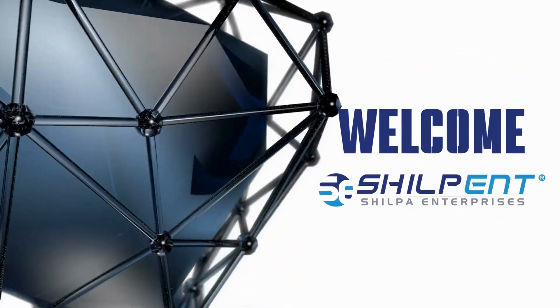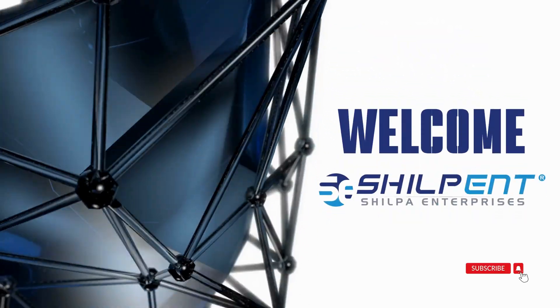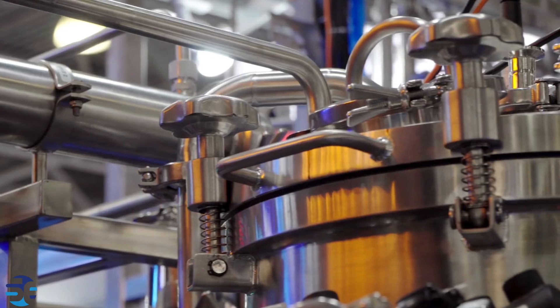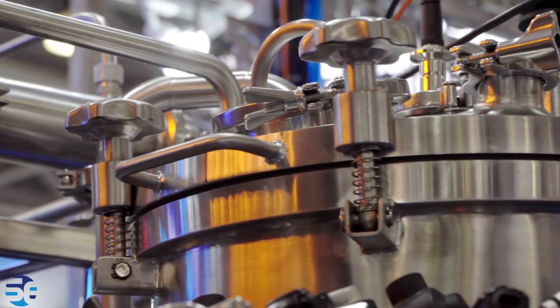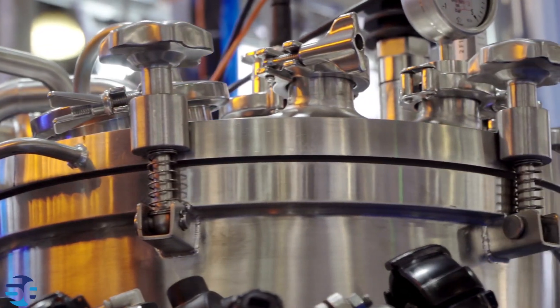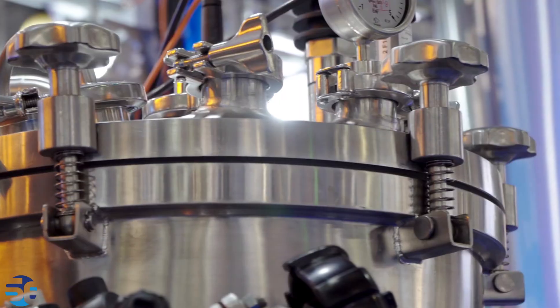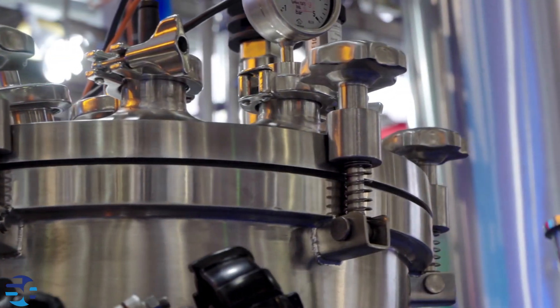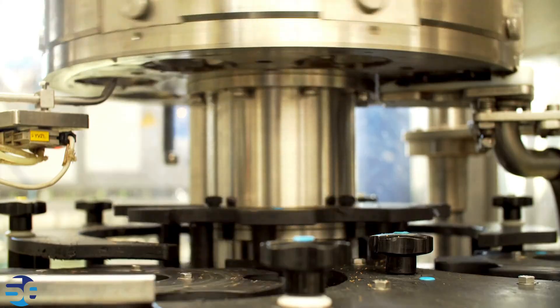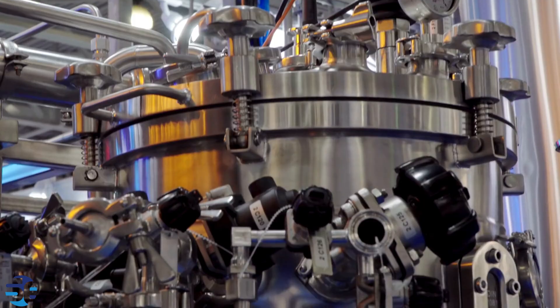Welcome to Shilpent.com. In this video we are going to explain what is a high-pressure autoclave reactor and how it works. A high-pressure autoclave reactor is a specialized device used in chemical and laboratory settings for carrying out reactions under elevated pressures and temperatures. It is designed to provide a controlled environment for chemical reactions that may require high pressure to achieve specific conditions.